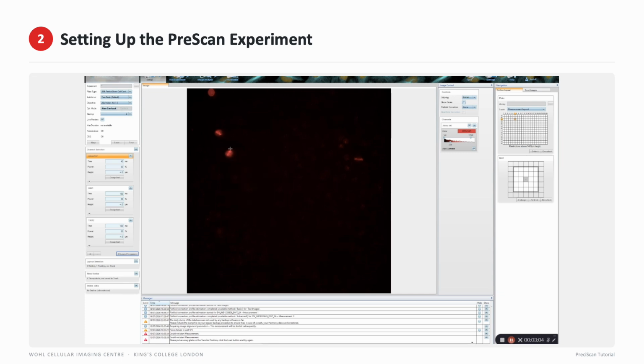And that obviously is most effective when you check that your intensities for your target are over 1,000 above your background. Now, I've decided that for this example experiment, my target are going to be cells that are tagged with Alexa 647, which is why we're checking here that our 647 is sufficiently above background.